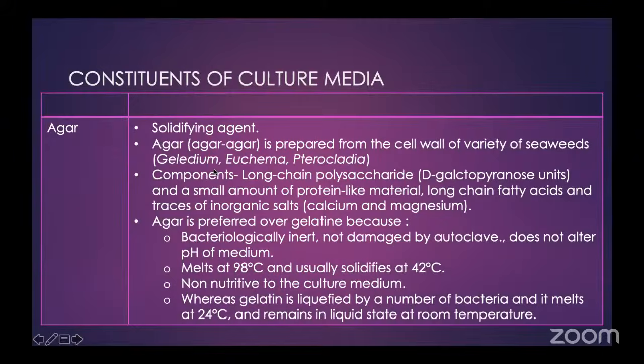All right, now coming on to the most important part, which I am very fond of asking PG students, solidifying agents. So agar, we all know, is prepared from a seaweed. Now these seaweeds are plenty. They can be Gelidium, Eucheuma, Pterocladia. All these seaweeds actually contain long chain polysaccharides of D-galactopyranose units and a very small amount of protein-like material, long chain fatty acids, and traces of inorganic salts like calcium and magnesium.